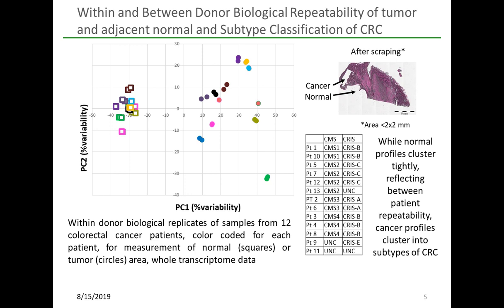And so one of the questions is, well, we know that for colorectal cancer, there is an approximately 700 gene signature described that's used to subgroup patients into clinically relevant subgroups. And so if one looks at this data without adjusting it and just uses that microarray signature, it turns out that you can take the cancer tissue off the Tempo-Seq data, and you can assign it to either the CMS subgroups or the CRIS subgroups.